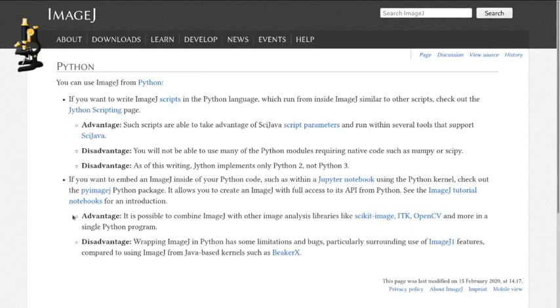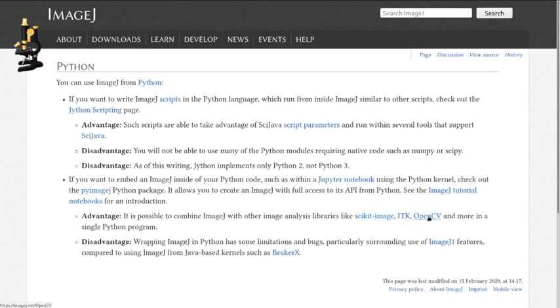Pretty much the key advantage is that you can start to combine ImageJ with other things. We've already played with Scikit Image. I think you might get exposed a little bit to OpenCV on Friday. And I think I heard someone talking about ITK recently, which is like a segmentation system you can use.